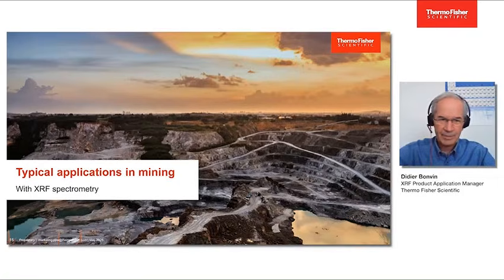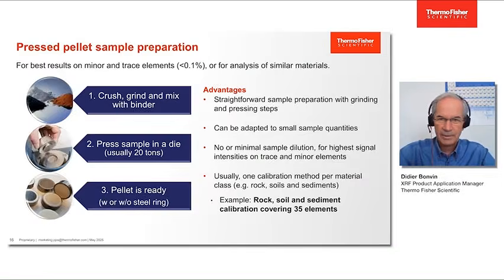Good morning, good afternoon, ladies and gentlemen. Yes, let's go through typical applications in mining industry with X-ray fluorescence spectrometry. First of all, I'd like to talk about the different sample preparation that are used for XRF analysis.